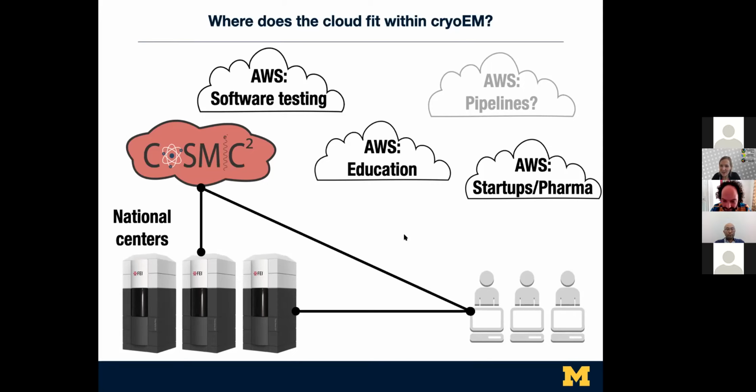Let's see, there was a question if you have any documentation for running cryoEM courses on AWS. Nothing really polished and official, but we've run 2 workshops at Michigan, and this workshop at ACA. Someone else was actually asking me recently about this, so we probably should officially write it up, since best practices or considerations for running it would be good to have. But whoever asked that question, I'm happy to have you email me. I can talk more about it.